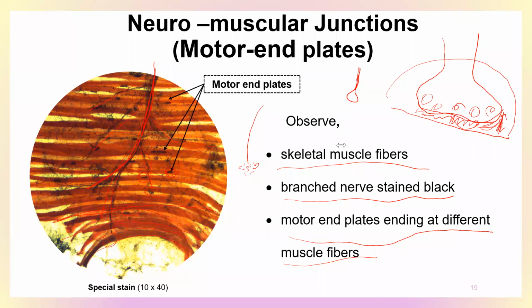Stain used in fibrous cartilage. Yeah, for fibrous cartilage, you can use a special stain for collagen, but that particular slide is not very good. But for collagen, if you want, you can use a special stain. Otherwise, it is just stained pink if you do H&E, right? If you do Verhoeff's, even for fibrous cartilage you can do it, but you will see there are some stains which stain collagen brown, right? So you can do those.